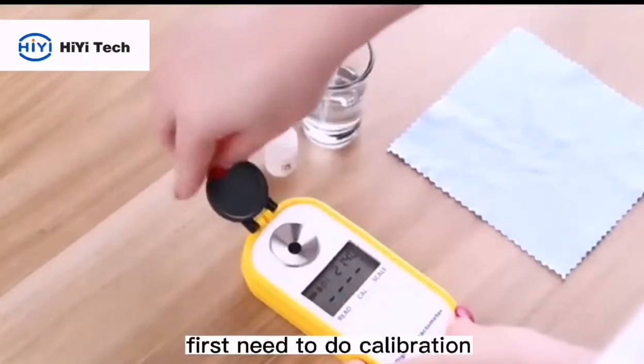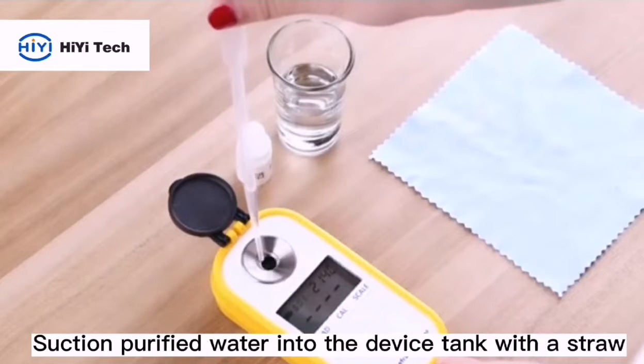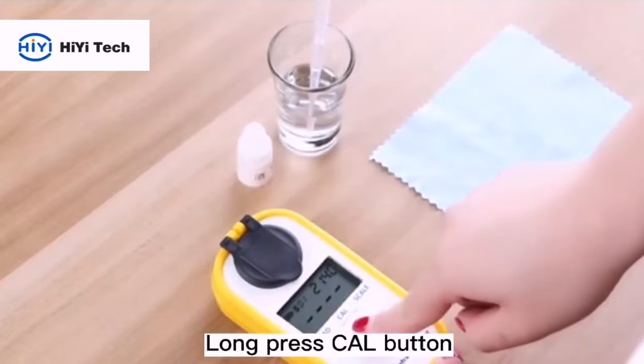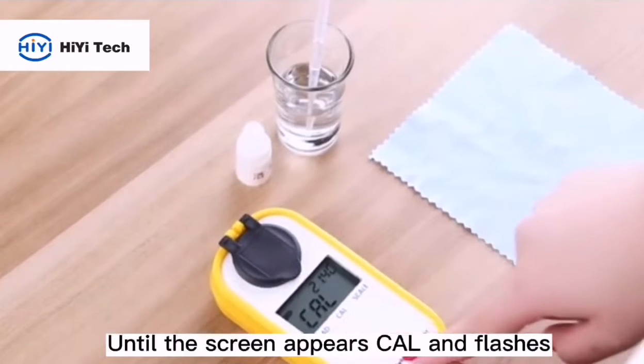First, you need to do calibration. Suction purified water into the device tank with a straw, then cover the black lid. Now press the CAL button until the screen displays 'CAL' and flashes.